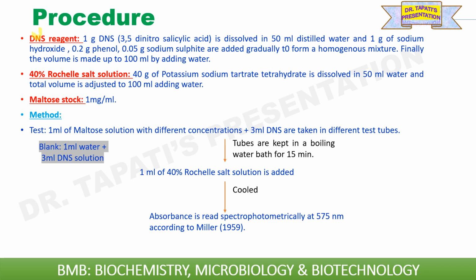All those compounds are added gradually to form a homogeneous mixture. Finally, the volume is made up to 100 ml by adding water.